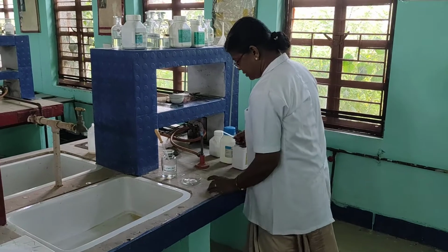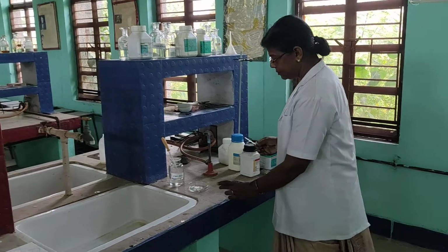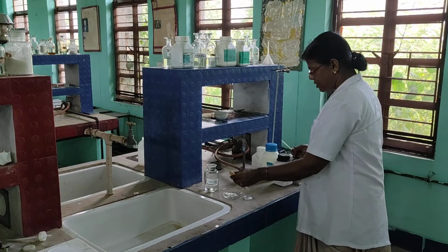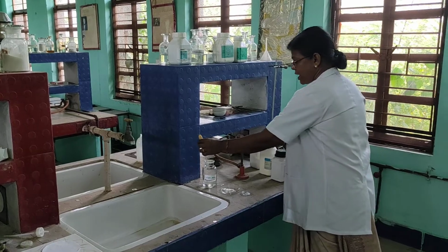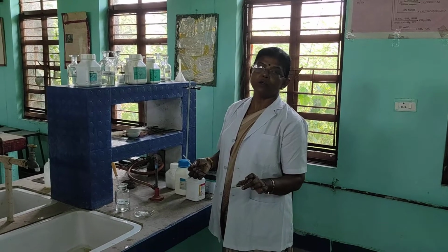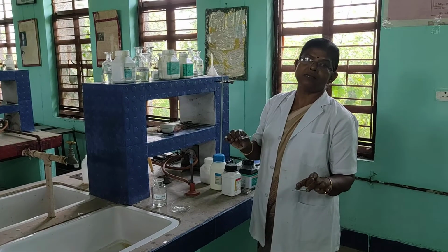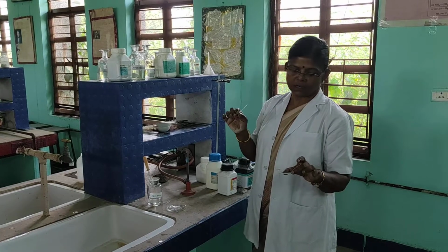Now I have taken a small amount of the salt. I will add a drop of concentrated hydrochloric acid to this. You should not use sulfuric acid, because sulfates are not volatile, and on heating they get converted to oxides, and oxides are very difficult to break. So for salt analysis, the acid used is concentrated hydrochloric acid.